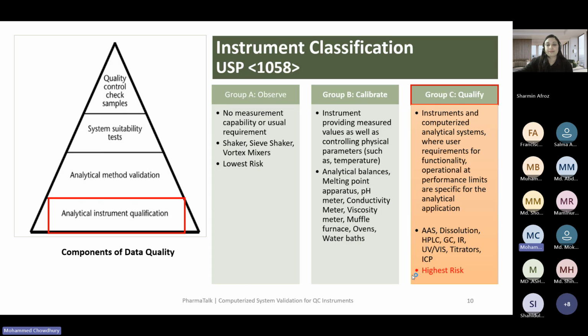Mr. Abdullah, what I understand, is it a kind of statistical based software? Yes, the parallel line assay software, PLA, in R&D. No, I'm a QC person. Okay, so you will perform some statistical analysis through this software.